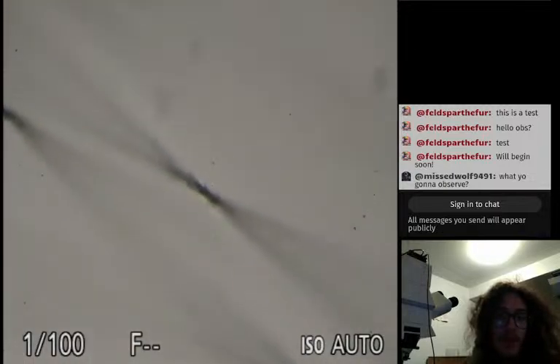Under the scope. Oh. That just looks cool. It's not necessarily very handy. It just looks spectacular.